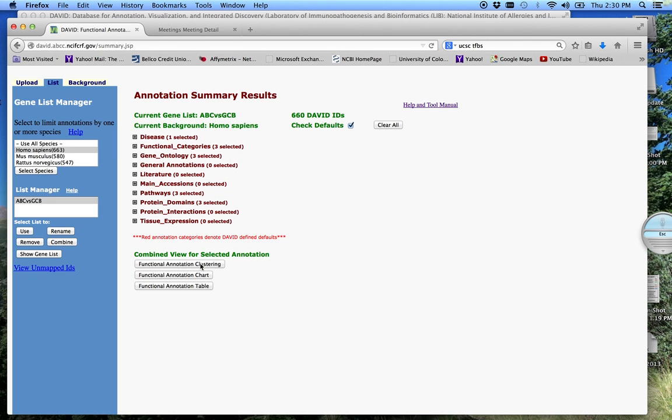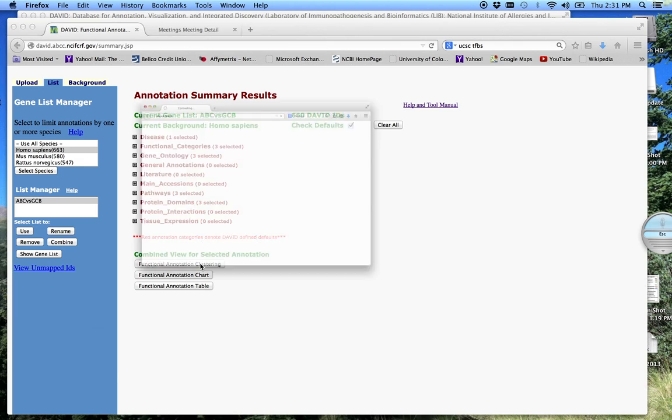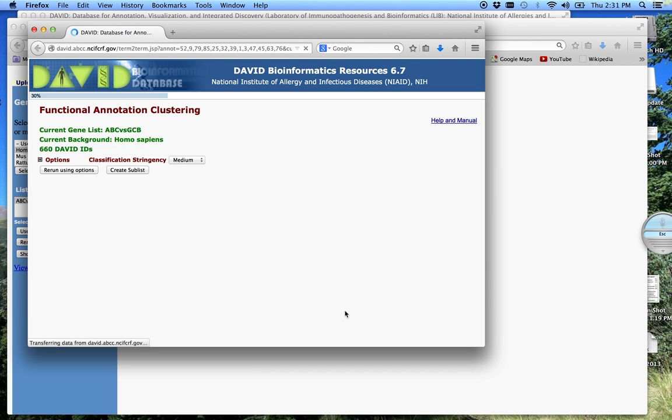We can do the functional annotation clustering. So before, we clustered on the genes with common annotation terms. Now what we're going to do is cluster the annotation terms based on common gene members. This kind of eliminates redundancy in the system, that a lot of times genes operate or are associated with different pathways, different functional groups. So what this does is kind of combine all that into specific blocks of annotation, and it kind of helps you group the genes better. So we can click on that, functional annotation. This window comes up.